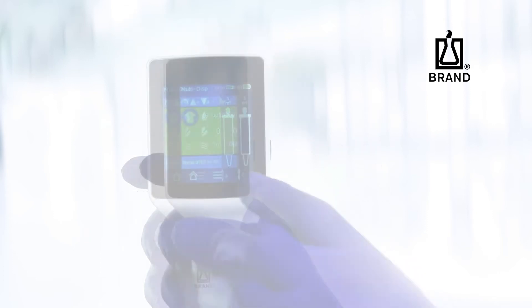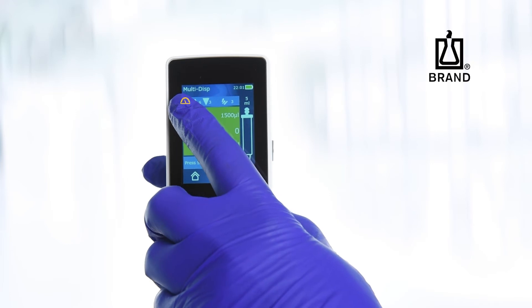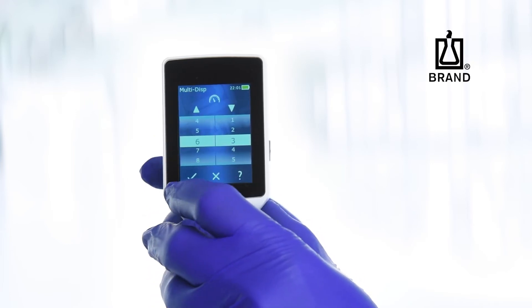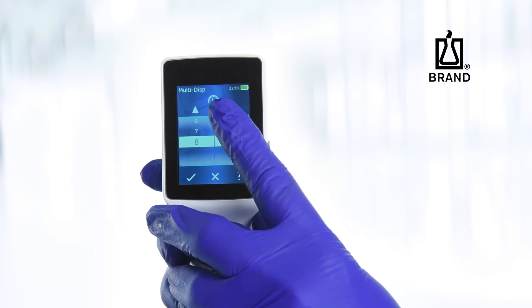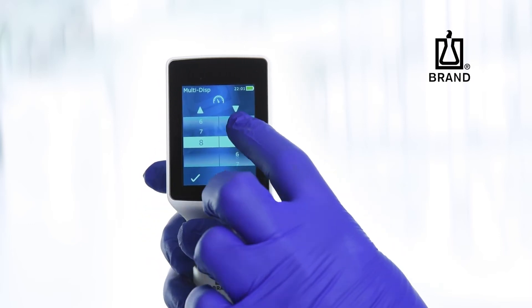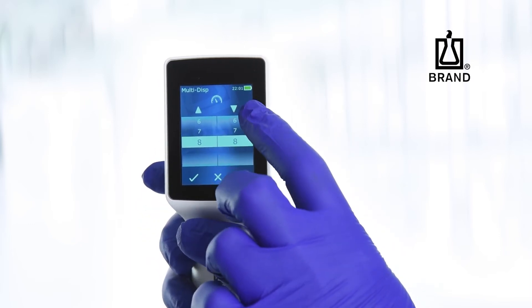To set the desired aspirating and dispensing speeds, tap the speedometer icon. Set the desired aspirating and dispensing speeds by swiping vertically up or down, then tap to confirm.